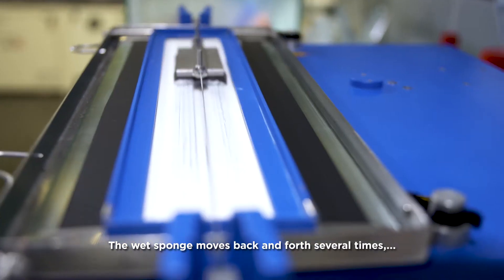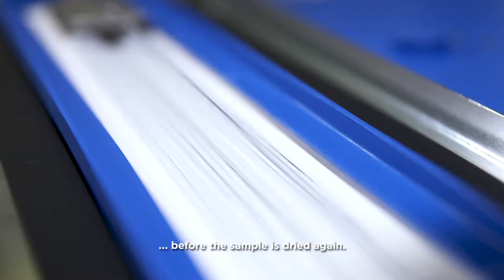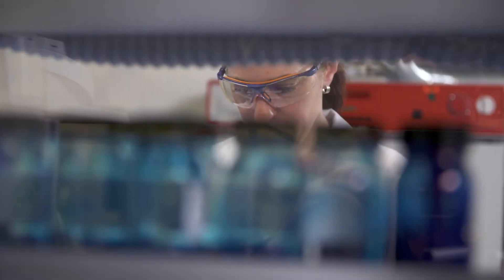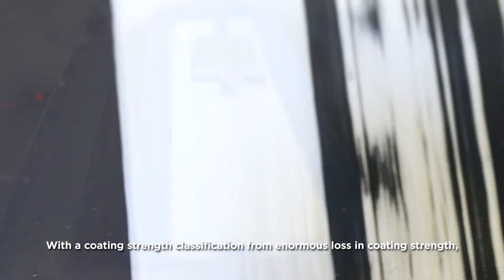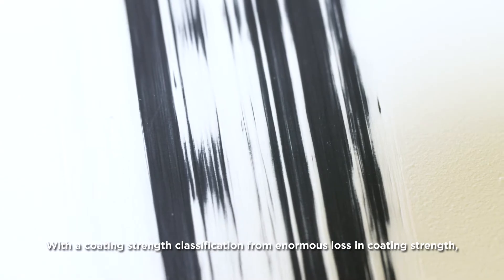The wet sponge moves back and forth several times before the sample is dried again. Finally, the samples are analyzed with a coating strength classification from enormous loss in coating strength to marginal loss.